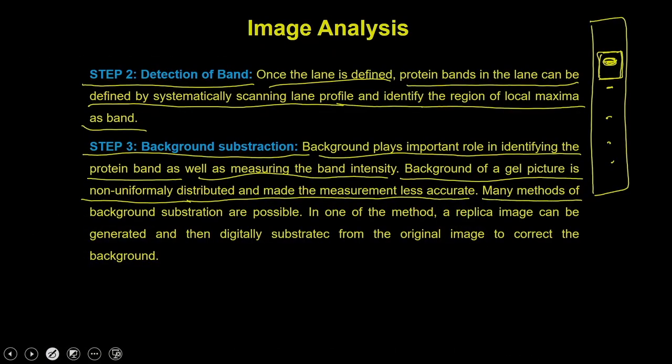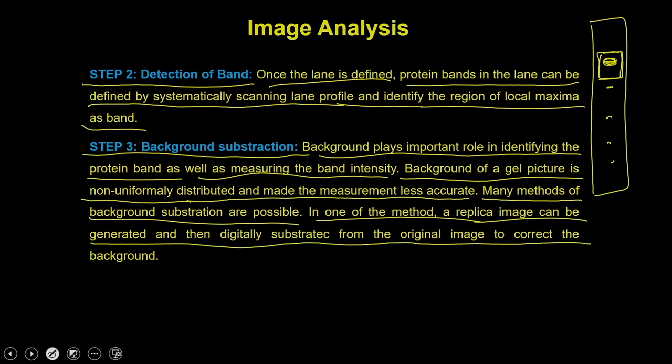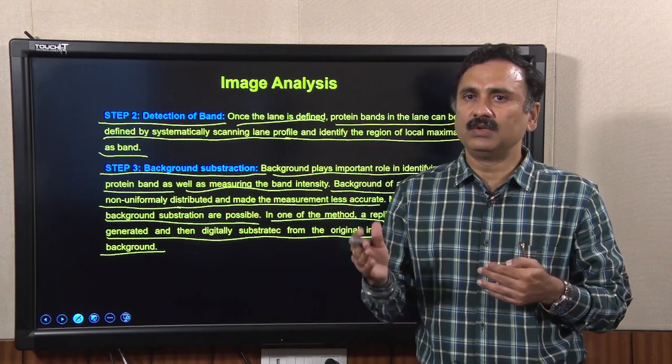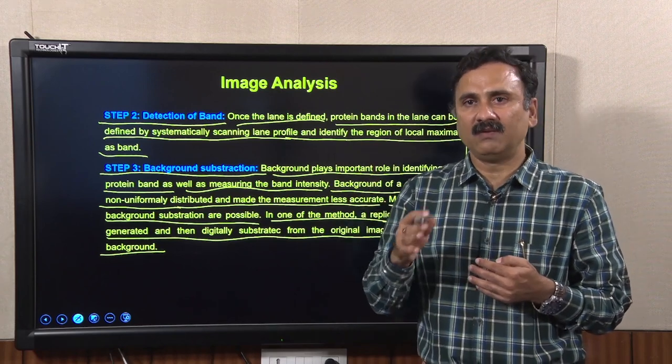Many methods of background subtraction are possible. In one method, a replica image can be generated and then digitally subtracted from the original image to correct the background. So once you are done with the background corrections, then you can go to the next step and ask the software to give you the intensity.